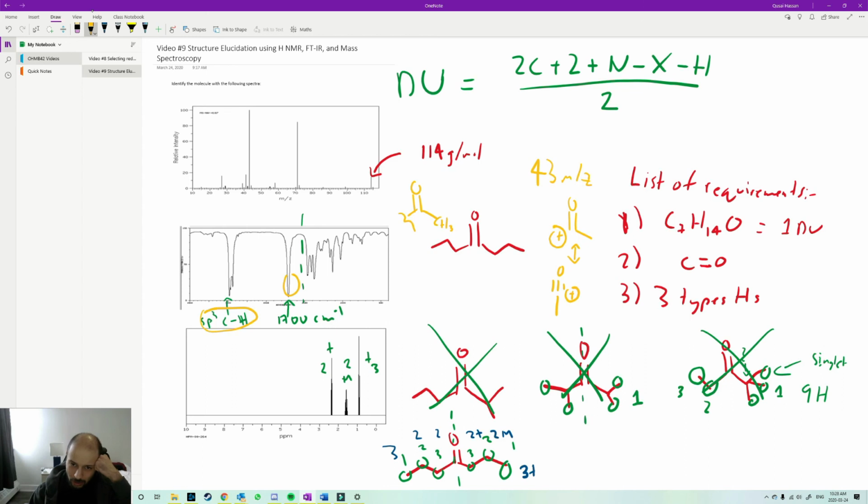Now the carbonyl in my proposed compound has no terminal CH3 attached to it, so that would lead me to confusion. If I went deeper into the mass spec and thought, okay, I definitely have an acylium ion, and started making my possible compounds, I would have ended up with the wrong compound. None of these work, but I could have ended up with something like this.